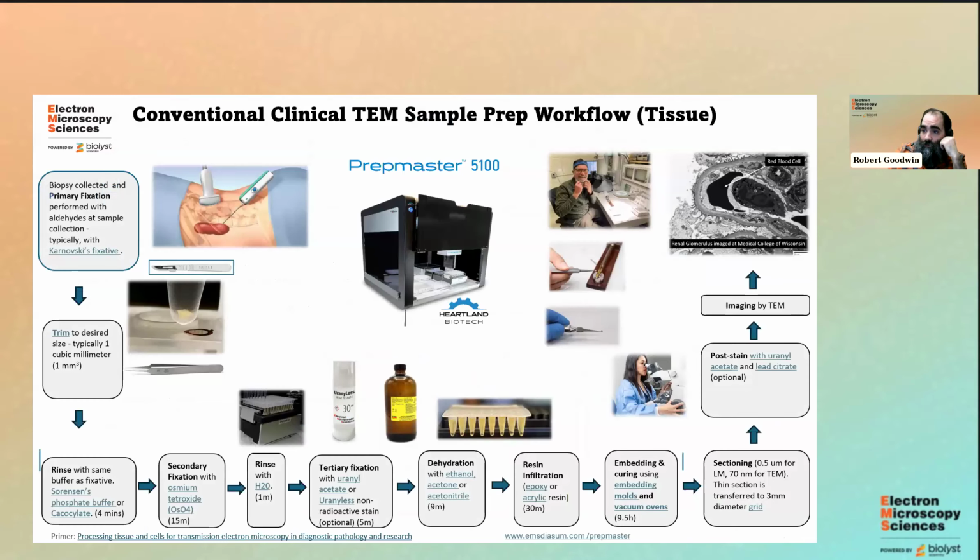So here is a general workflow of tissue processing, especially in the clinical sense. We get our samples from the hospitals already in fixative, and we've abbreviated our standard workflow as well. We've found a few steps that we can shorten and cut out, but it still takes 6 to 8 hours to process a standard sample manually, and then it goes in the oven overnight to embed, and then onto the sectioning and all that.